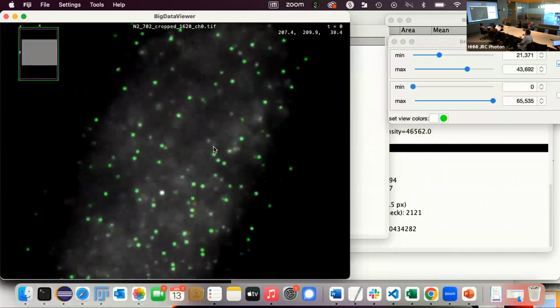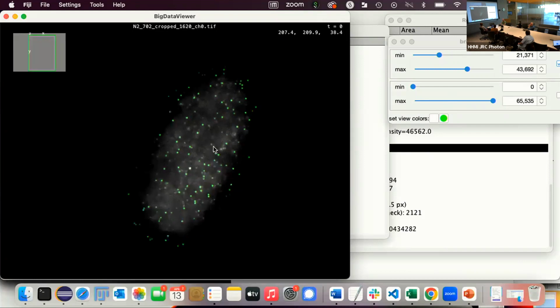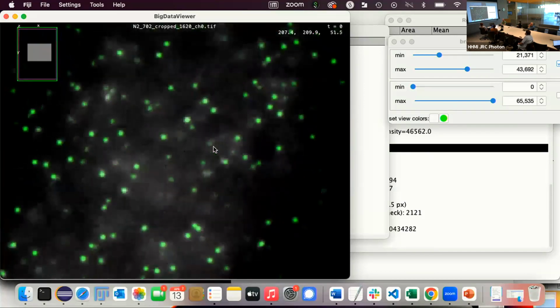And this works pretty well. I really like this tool as a confirmation. When I compare different softwares, I just use our plotting tool, to go in there and confirm that things are right.